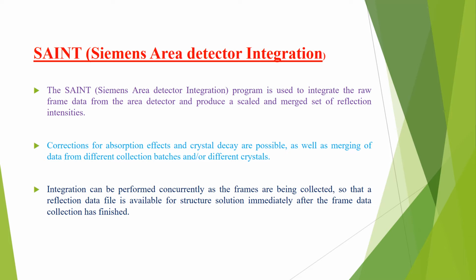The integration can be performed concurrently as the frames are being collected, so that the reflection data file is available for structure solution immediately after the frame data collection has finished.